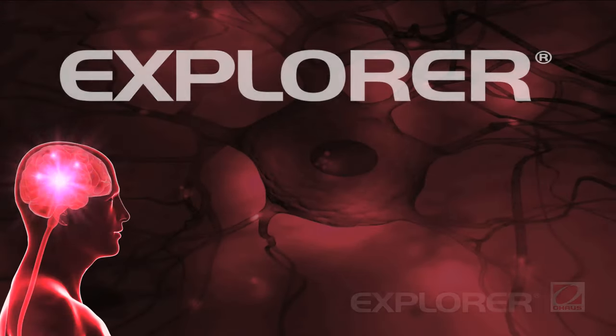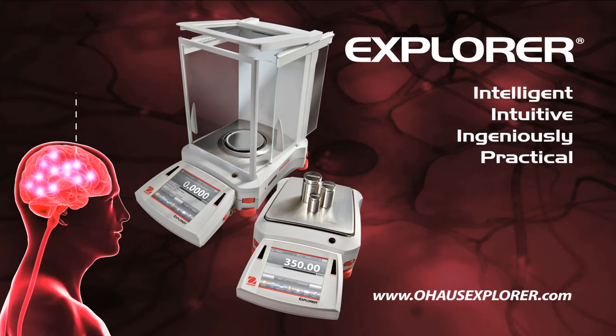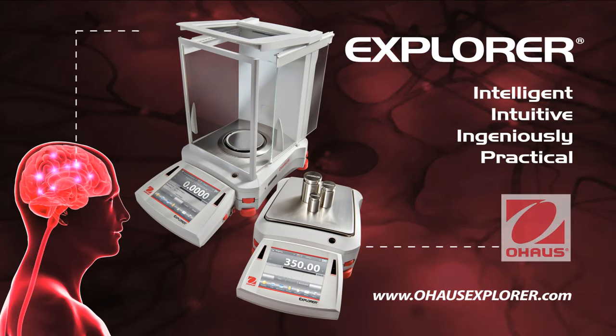That's the all-new O-House Explorer — the most intelligent, intuitive, and ingeniously practical balance ever to come from the mind of O-House.